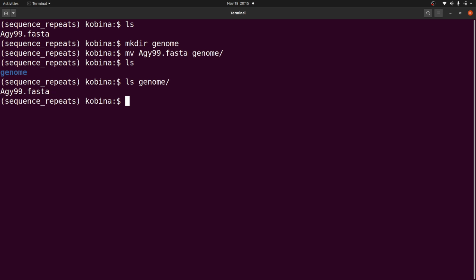All right. For beginners, I'll encourage you to read about BLAST, what it does, its importance. Probably I'll make a tutorial to explain in detail what BLAST is. But now let's proceed. What we are going to do next is to do a local BLAST.